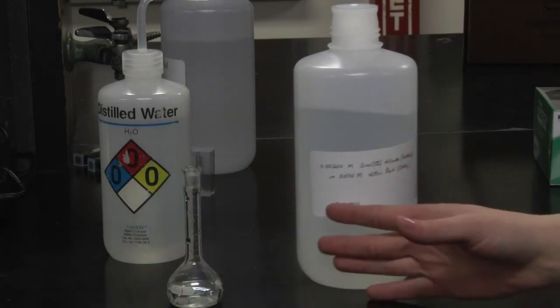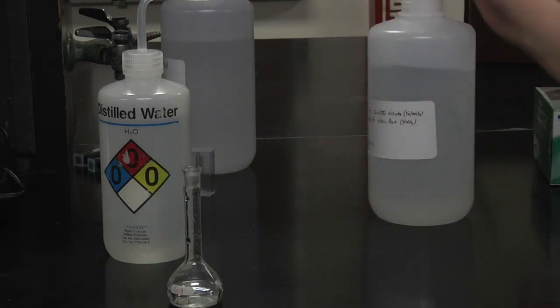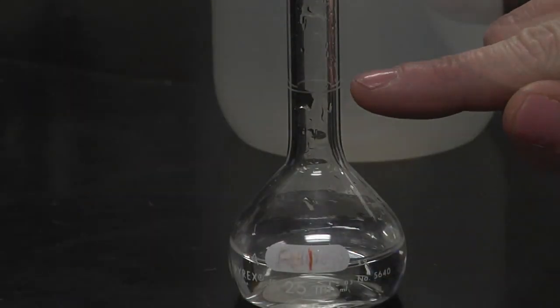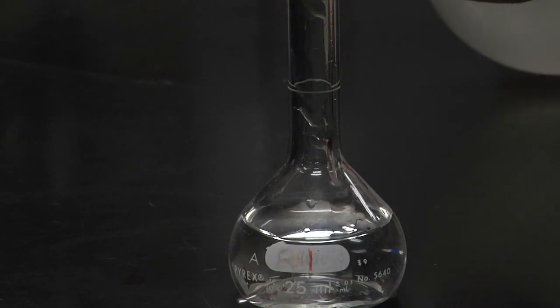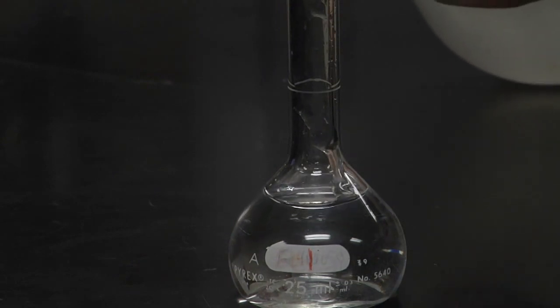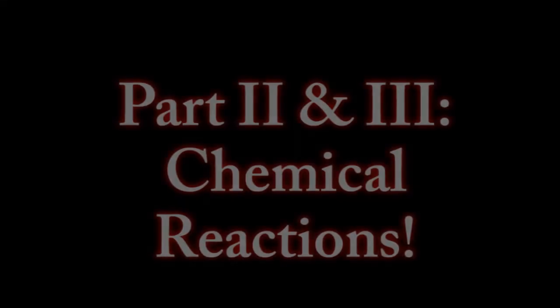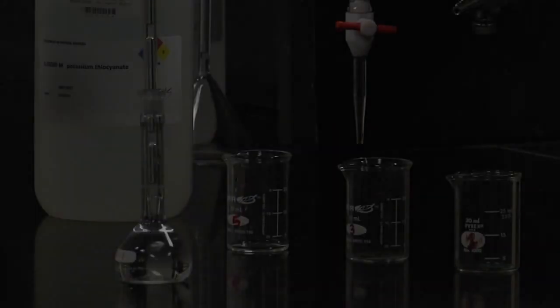We're going to fill the volumetric flask with distilled water to its calibration mark. Always remember to read from the bottom of the meniscus. Now we have our dilute iron solution.